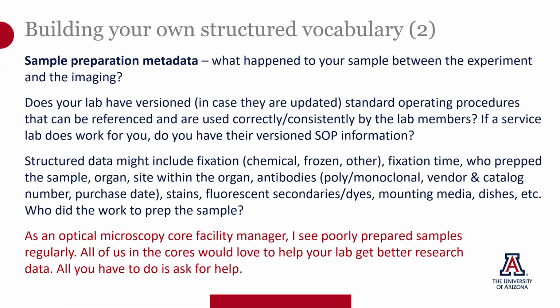It's unfortunate that we as core managers see a lot of poorly prepared samples on the microscope. All of the university core facilities, whether you're doing microscopy, flow cytometry, mass spec, or genomics, we all want to help your lab get better research data.